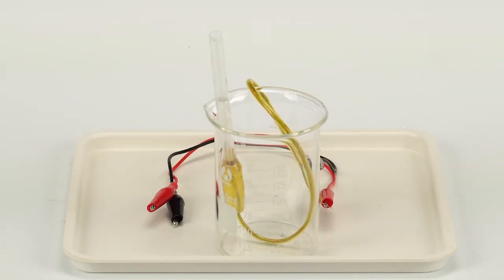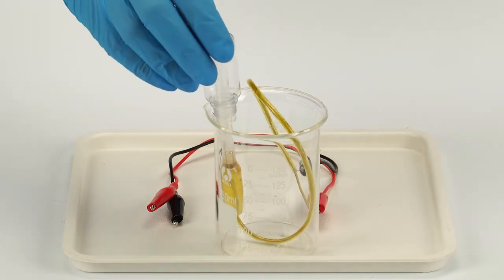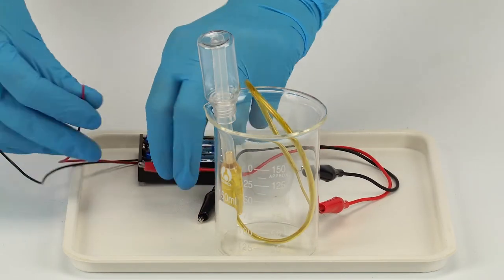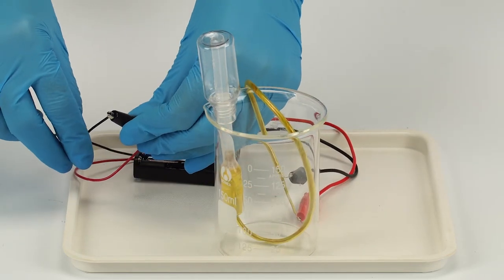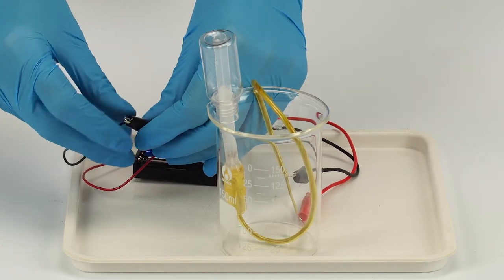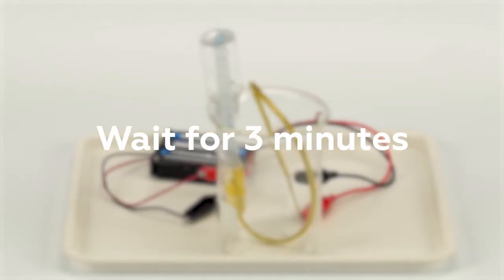Collect some of the oxyhydrogen mixture in the bottle. Put the plastic bottle on the pipette. Connect the battery holder with the batteries to the crocodile clips. Make sure the red crocodile clip is connected to the red wire and the black clip to the black wire. Wait for three minutes.